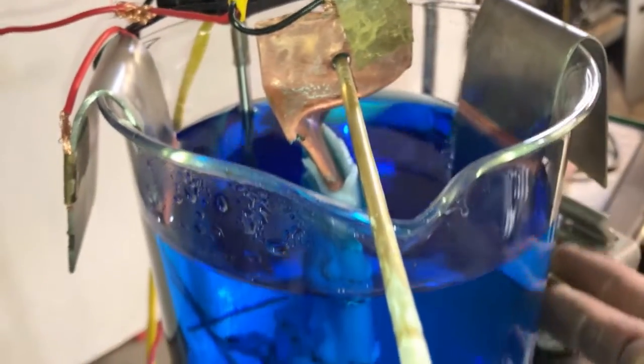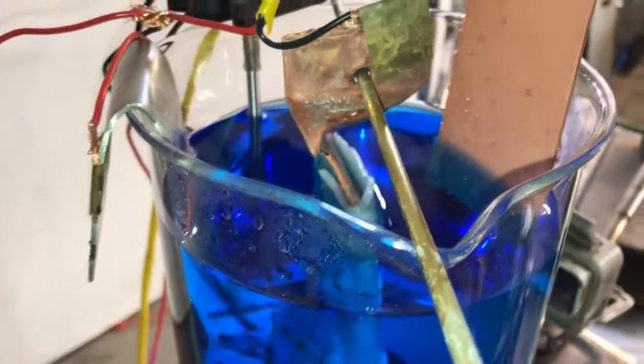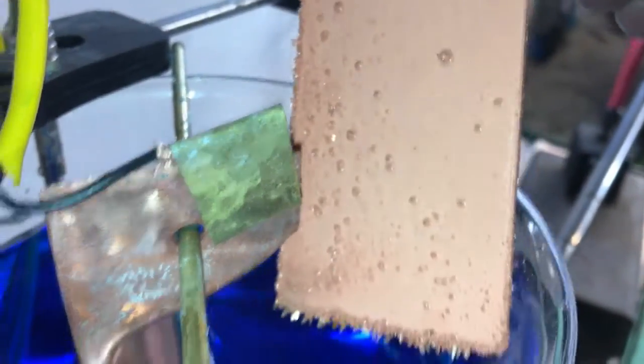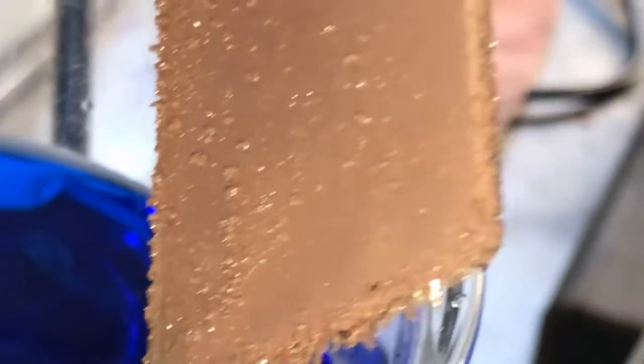I want to get one last look at this because I got to turn my back on it for a while. Wow, is that getting crystally? Look at that. That is like glittering. Very clear.